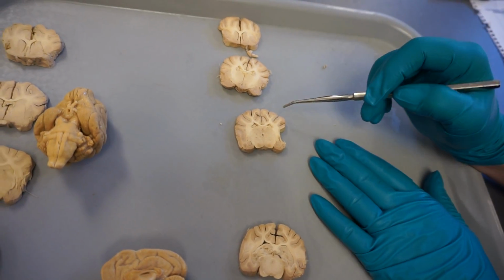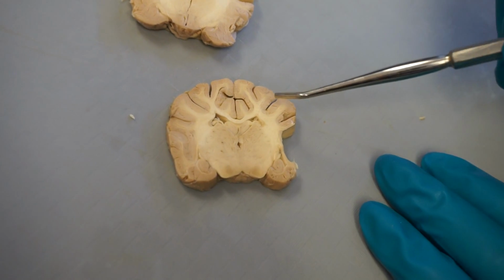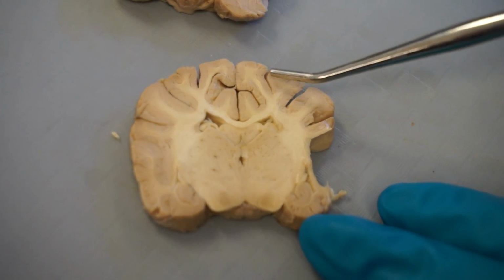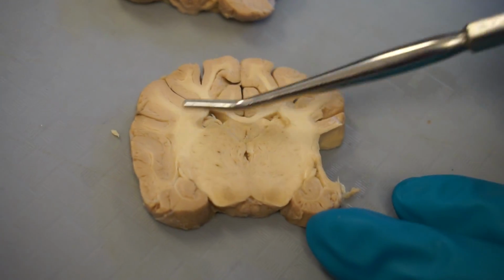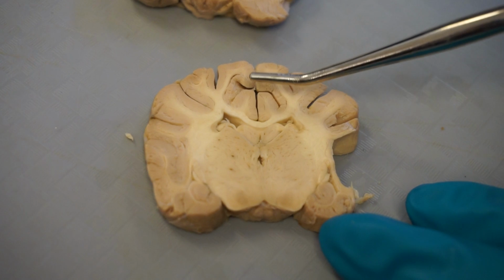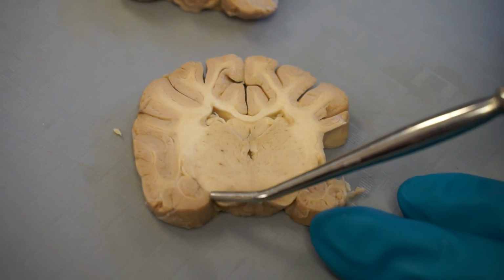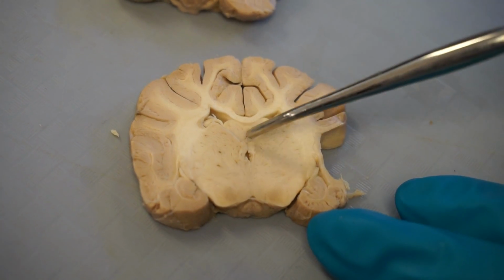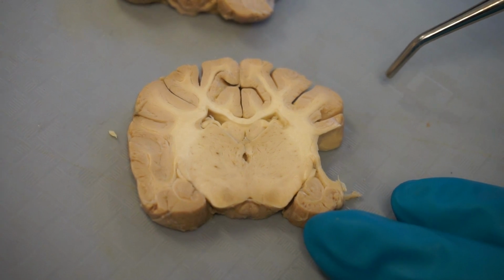Okay, so in this video we are going to continue our tour through the brain. Where we left off before, we had done telencephalon and some parts of diencephalon, and we are now getting into the mesencephalon, because we have the crus cerebri, and that third ventricle is closing up into the mesencephalic aqueduct.